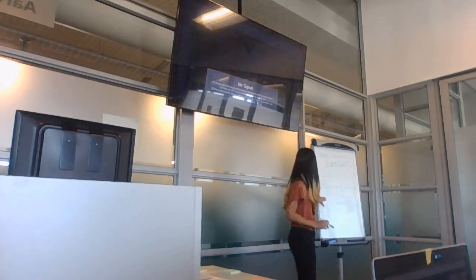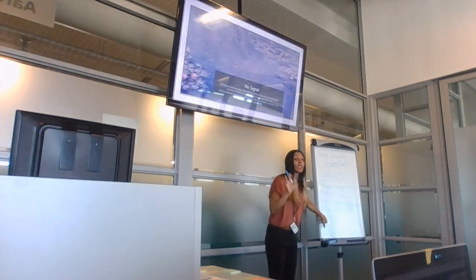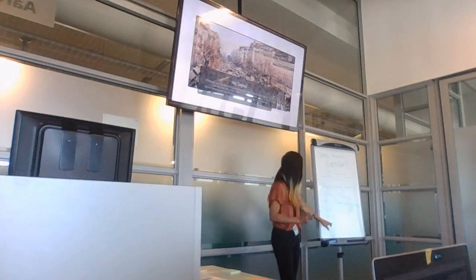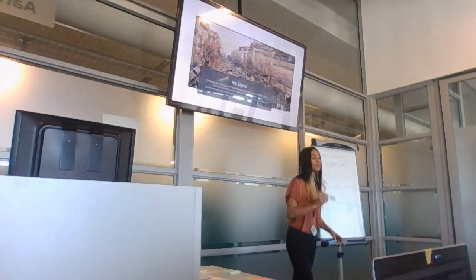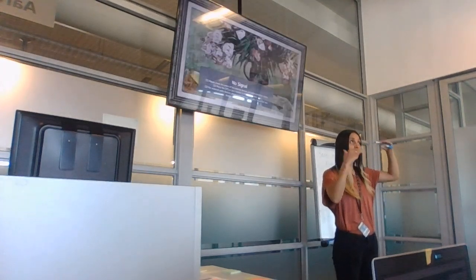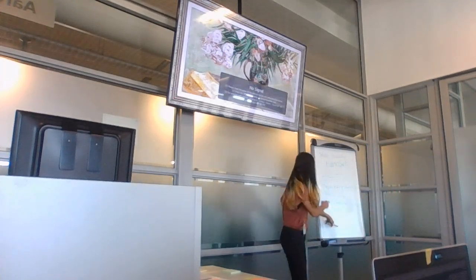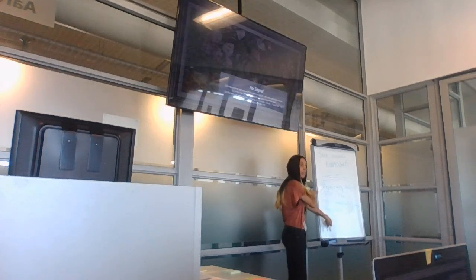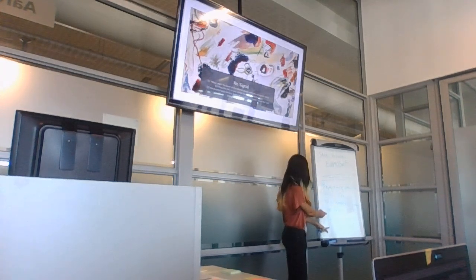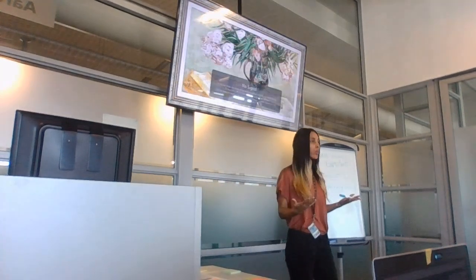Now, technically speaking, you can do FastQC and MultiQC. But you haven't cleaned any data. You're basically saying FastQC, but I want to see all of my data together, so I'm going to put it into MultiQC. However, this is what we've observed: if your data isn't paired and in a collection, then it's fine to run MultiQC after FastQC. But there are often errors when data is paired and in a collection and you want to run MultiQC, which is why we chose FastP. Firstly, with FastP you can both see your data and do processing at the same time.